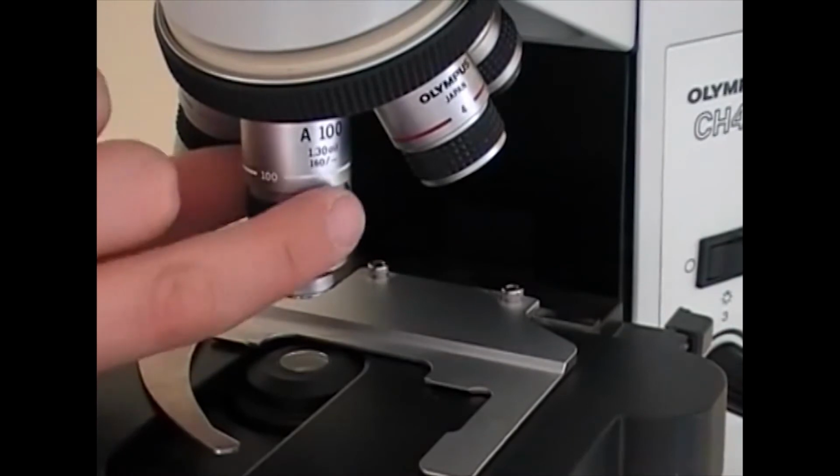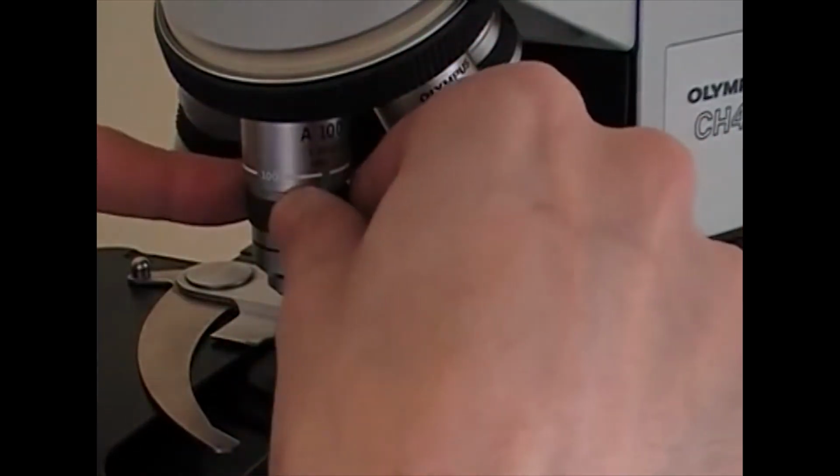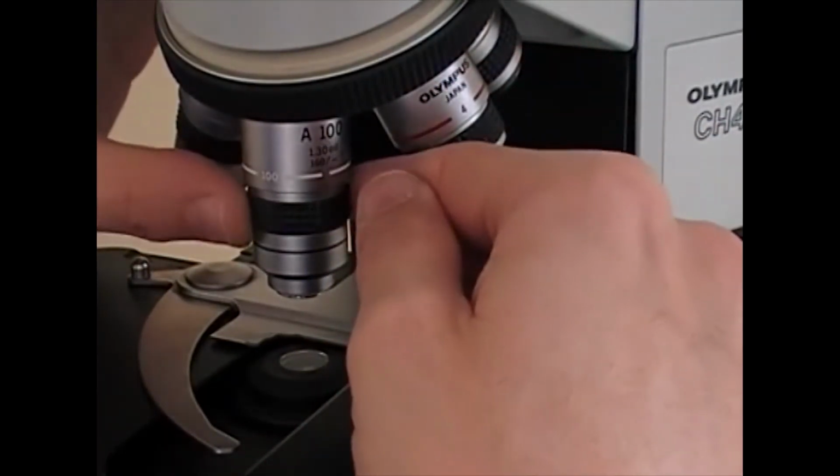Usually, the microscopes with inclined tubes have a multiple lens nose piece that allows objectives to be interchanged simply by rotating the nose piece. In vertical tube microscopes, the objectives normally screw into the centering ring or collar, held against the microscope tube by a spring clutch arm.